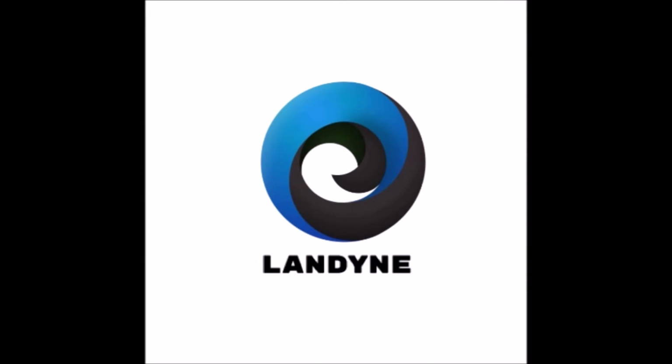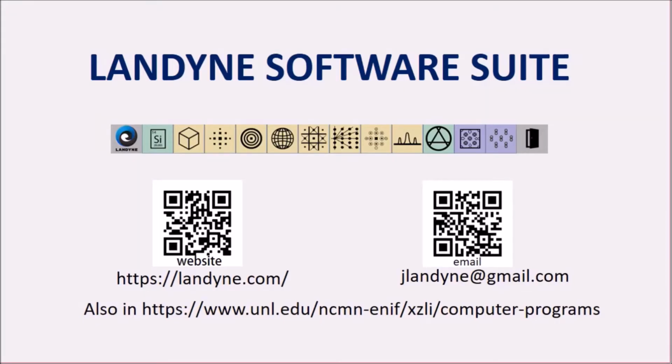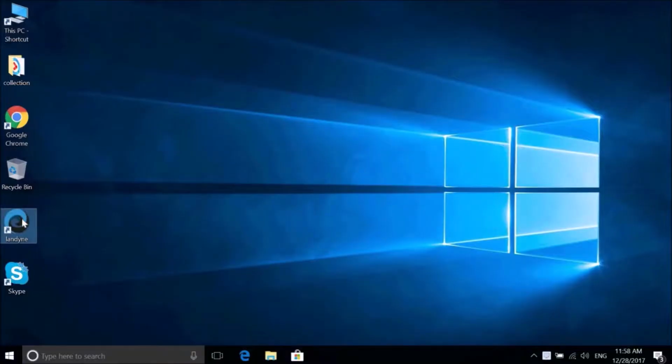In this tutorial video, I will introduce SAED. This is a main component in the Landyne software suite for electron diffraction simulation and crystallography analysis. You may download the software suite from the website on the screen.